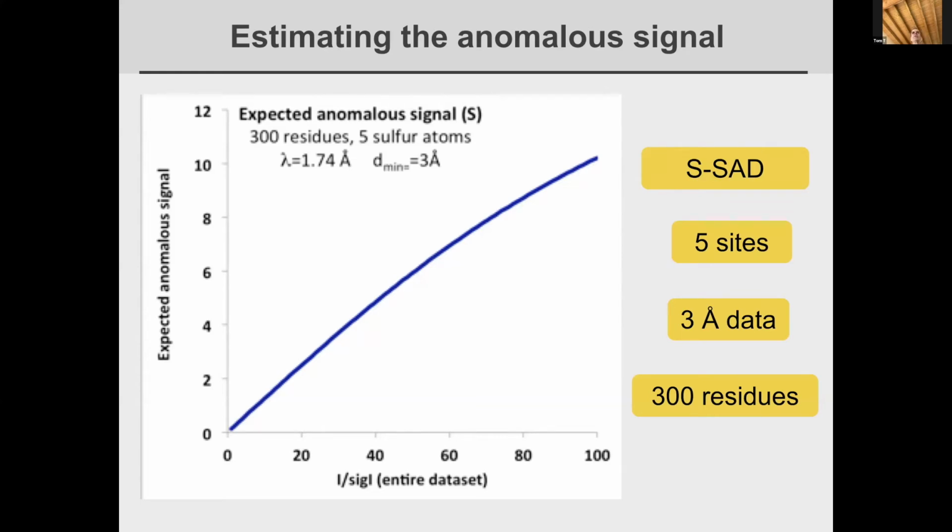And that's true for soaks, and it's also true for selenomethionine residues. So you have a really good chance of having ordered sites if your crystal diffracts well to begin with. That's going to be the bottom line here.